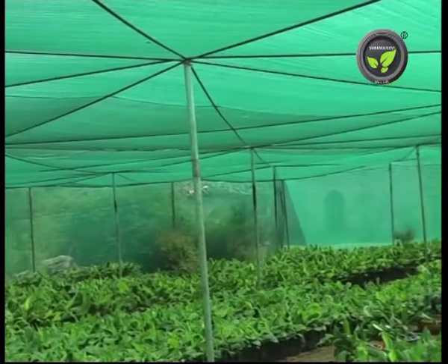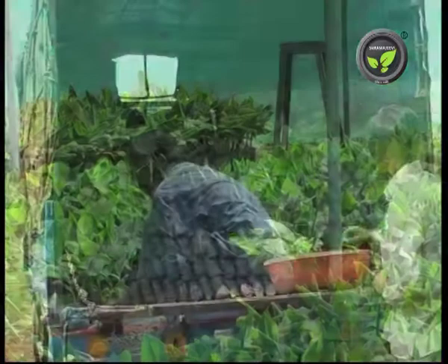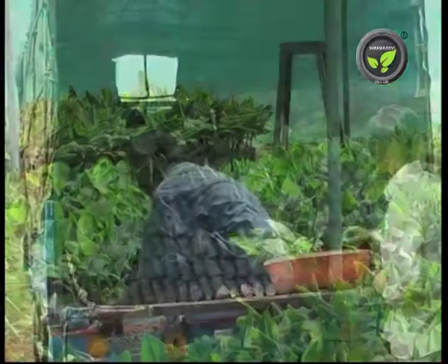This stage is called hardening. It needs this kind of a closed shade house. These plants are 3 months old and are ready for planting. Healthy and sturdy plants are selected from the lots and sold to the farmers for 10 to 15 rupees. They can be transported to any distance.